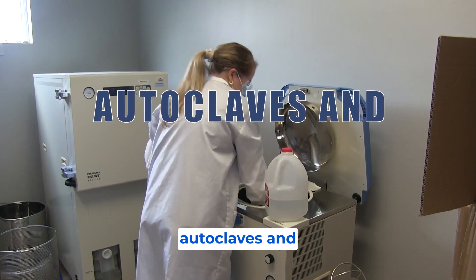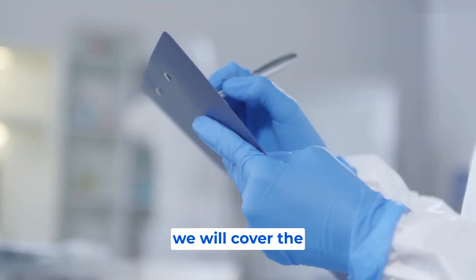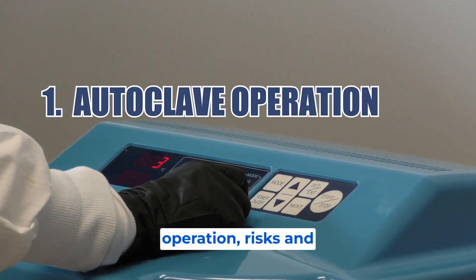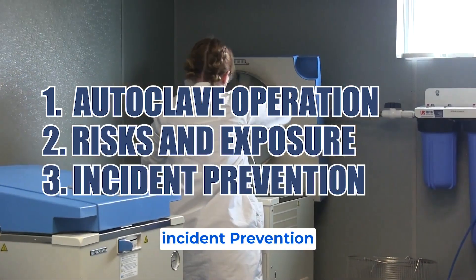Welcome to the autoclaves and sterilizers laboratory series training. During this course we will cover the following learning objectives: autoclave operation, risks and exposure, and incident prevention.